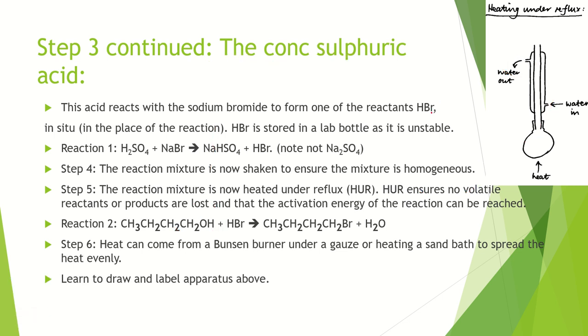but certainly label. Common mistakes are people put a bung in the top there. That is wrong. It has to be open, and they put the water in and out in the wrong places. And the other common mistake is they just leave gaps. This apparatus has to be sealed everywhere except at the top. So be careful of that.